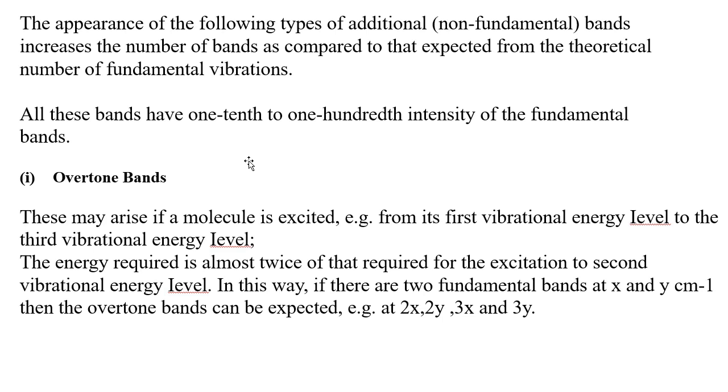They are overtone bands, additional bands or combination bands, subtraction bands or difference bands, etc. All these bands have 1/10 to 1/100th the intensity of fundamental bands.